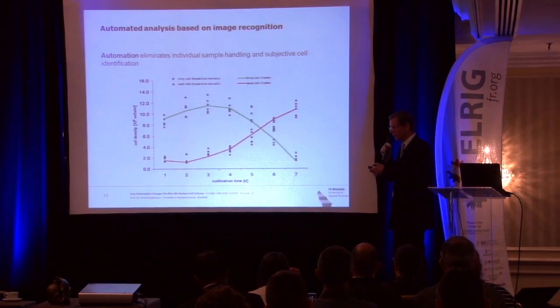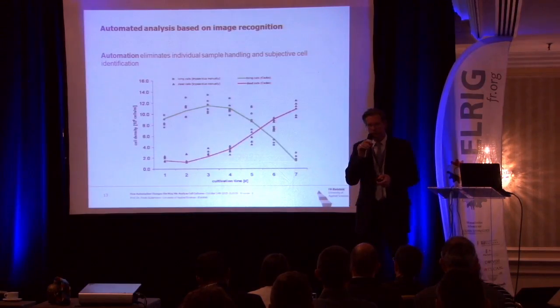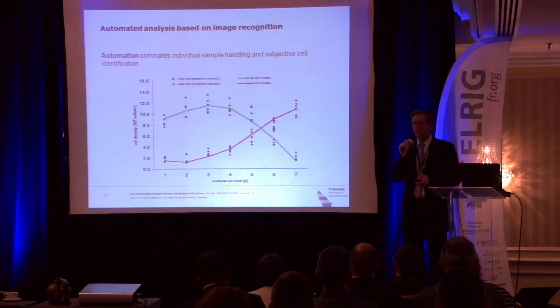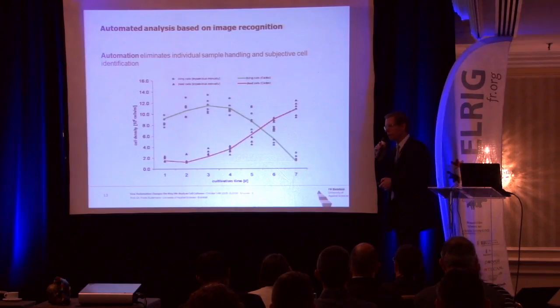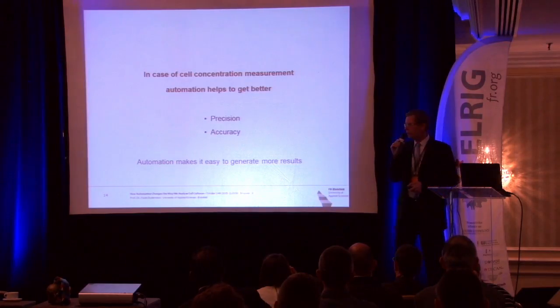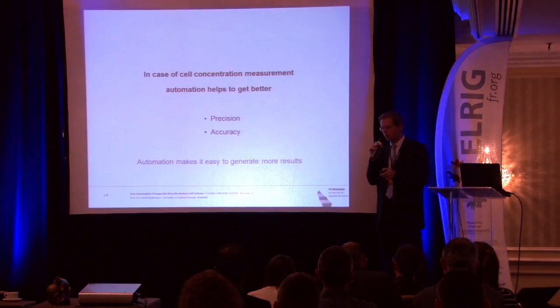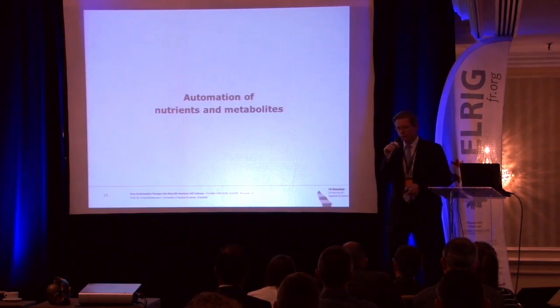So you have to be able to capture this manual bias of distinguishing between viable and dead cells. You have to build this into the machine and then keep it as it is, and the machine will count the same cells and the same viabilities on Mondays as on Fridays, even after a party. So you gain precision and accuracy with this type of automation. And this type of automation is only one process, one dedicated task. This machine can do nothing more than cell counts and viabilities.